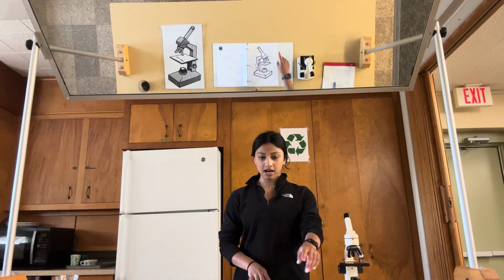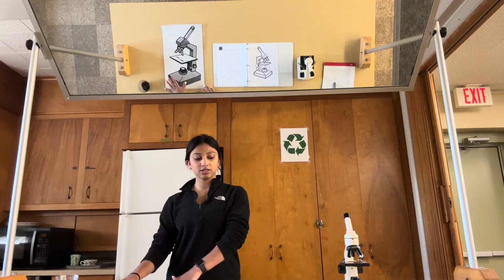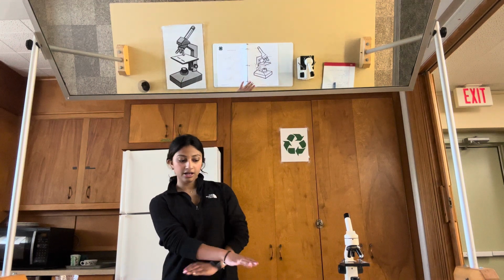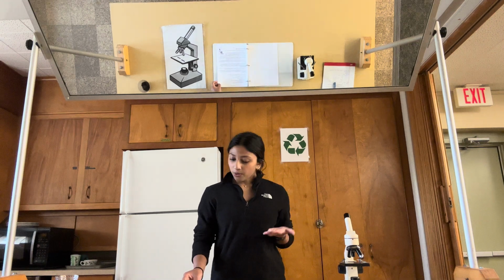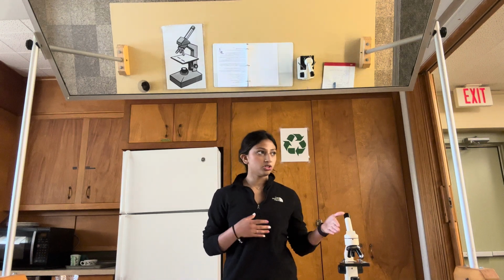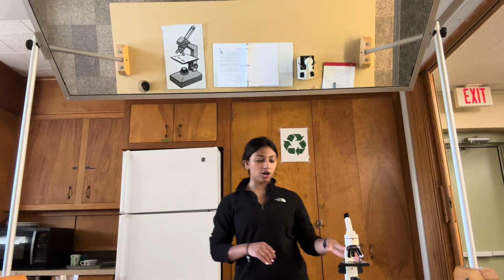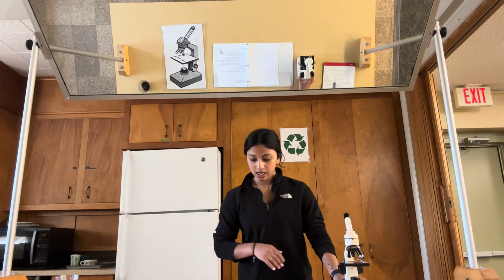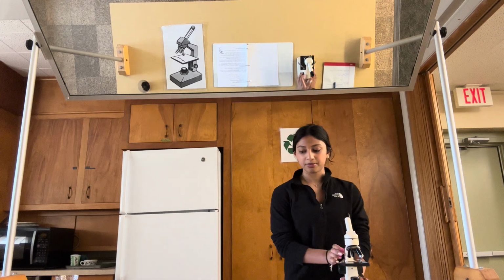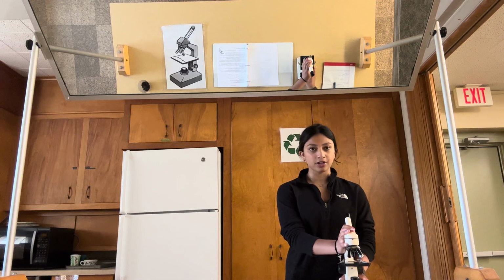It has different lines to the different parts of the microscope. This is an enlarged picture of the page you'll be handing out. And we're just going to do a quick walkthrough while the children are coloring the parts of the microscope. So the base and the arm are usually one cast of material. The arm is the correct place to grip the microscope when carrying it while supporting the base with the palm of your other hand.